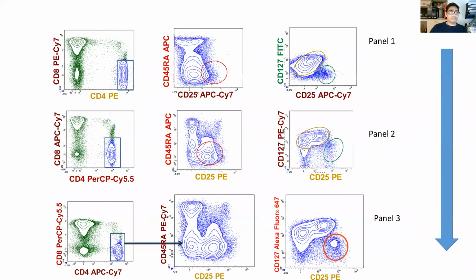So in comparison, that's the first panel. You just use whatever antibody is available, and we got a result that looks like this. The second panel is where we match the antigen expression level with the brightness of the color in the opposite way. That's how the result looks. And finally, we consider the spillover of all these colors, and then we get a very beautiful result. So that's how choosing different colors will impact your final result.